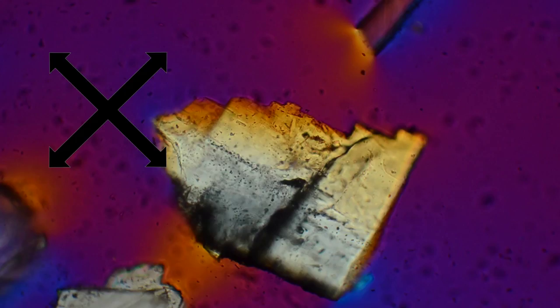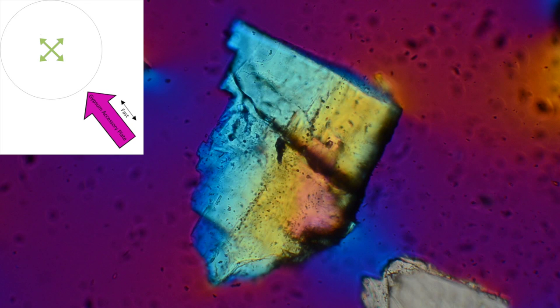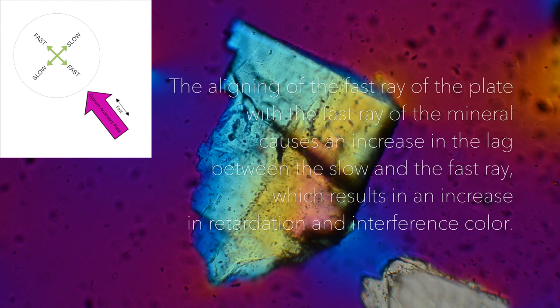Let's look at each position separately. In this position we go from first-order interference colors in cross-polarized light to second-order interference colors with the insertion of the plate. This increase in interference color is due to the fast ray of our mineral aligning with the fast ray of the gypsum accessory plate. The aligning of the fast ray of the plate with the fast ray of the mineral causes an increase in the lag between the slow and the fast ray, which results in an increase in retardation and interference color.